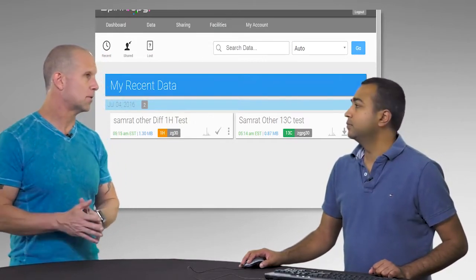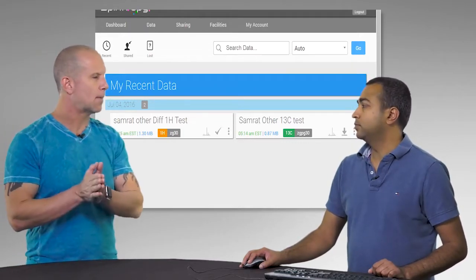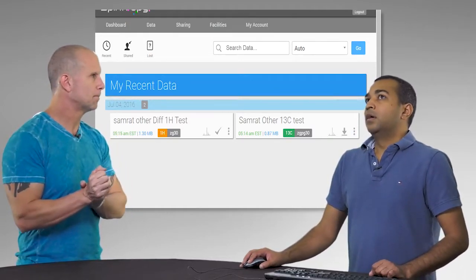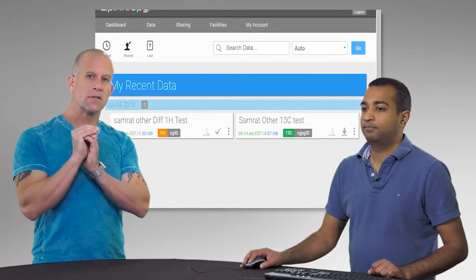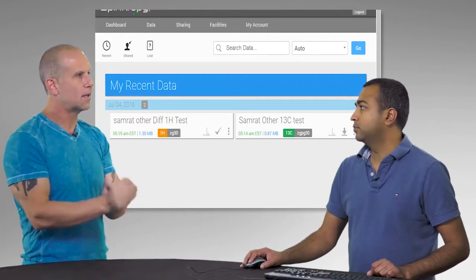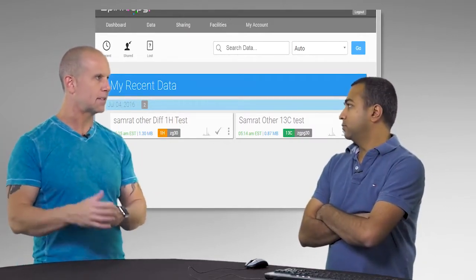It is freely available for students. They have to register and download it, but it works on both Windows machines and Linux machines, right? Yeah, Mac also. So basically, students who want can always download the freely available Bruker TopSpin software to be able to analyze this data.